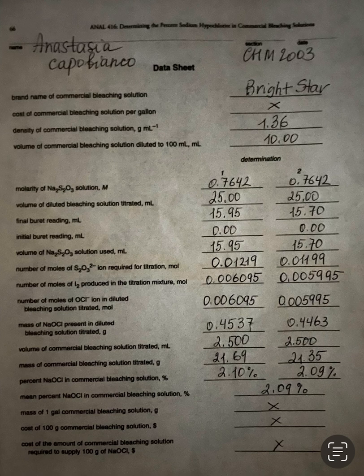So make sure you convert those milliliters into liters. This is how I got my number of moles of thiosulfate ion, and I got two numbers. For the first determination, I got 0.01219 moles. For the second determination, I got 0.01199. Okay, let's move on.